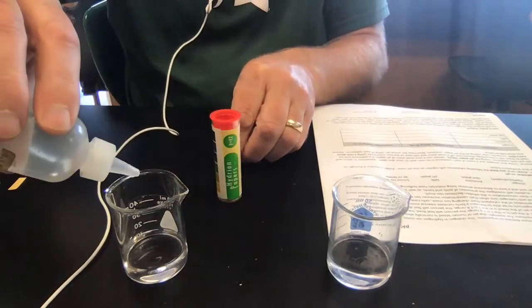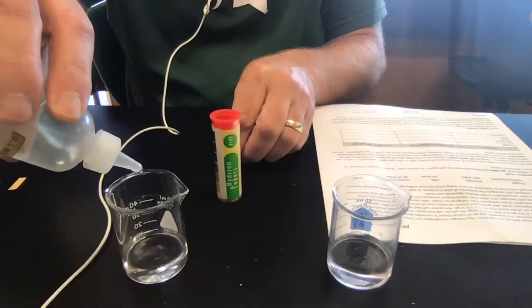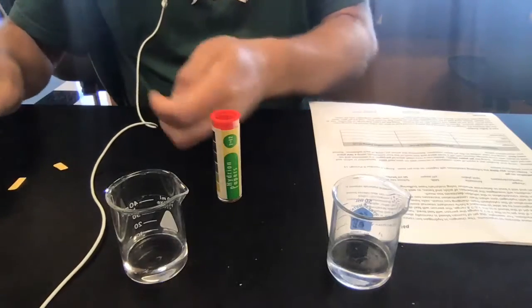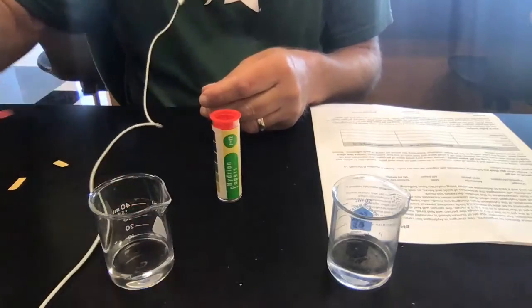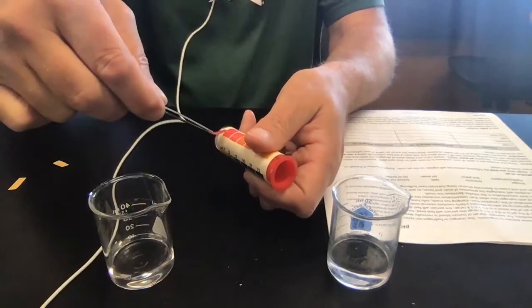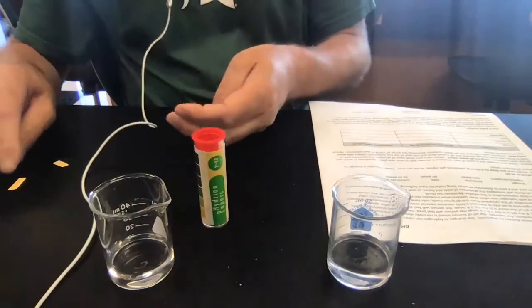And 10 more drops, can't take it any lower, but 2, 3, 4, 5, 6, 7, 8, 9, 10. And I will take my forceps and drop this in. And this is a very deep red. And there's definitely still a pH of 1. So we went from 7 to 2 to 1 to 1.